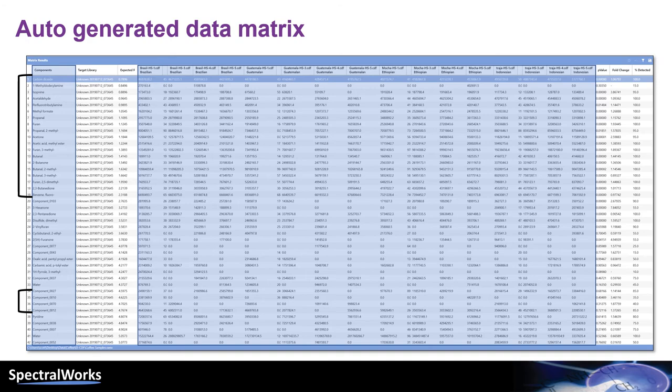This matrix was automatically generated, but it is also possible to generate a matrix from existing target libraries and this is useful when looking for differences in specific components. The processing in this case used retention time matching, but retention indices should have also been used.